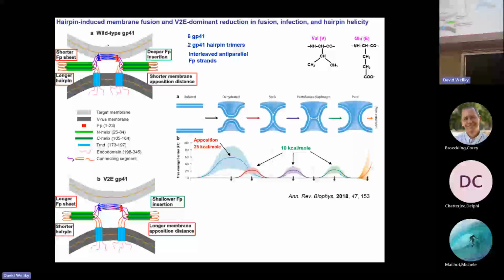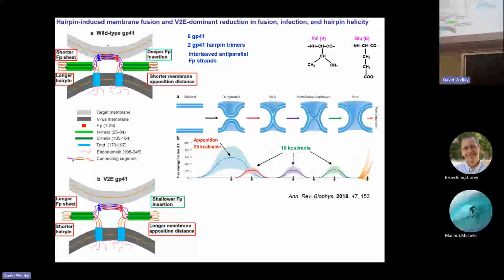The complicating part, though, is that you have to decide you want this fraction of carbon-13 labeled peptide and this fraction of nitrogen-15 labeled peptide, and then in your data analysis you have to include the statistics. If you do 50-50, then there's a 50% chance that carbon-13 is next to nitrogen-15, and a 25% chance it's carbon next to carbon, and so on. So we did do that.